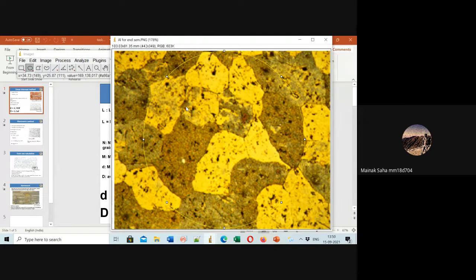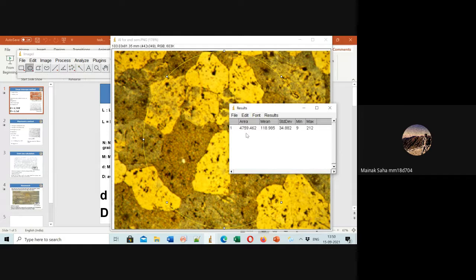See, this is a circle. And when you press Control M, you see the area you found out. This is the area: 79.8 millimeter whole square divided by 4 into pi, which means into pi by 4. Still, you can find it using a calculator also. Just check, is this correct or not? 79.8 millimeter squared, how much will it be? It is 80, so it will be 6,400 into 3 by 4. Yeah, I think it is correct. Just check it.